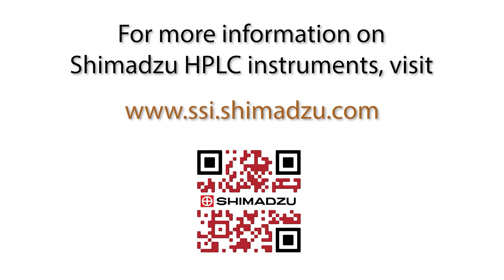For more information on Shimadzu LC instruments, please visit www.ssi.shimadzu.com or scan the QR code on the screen.